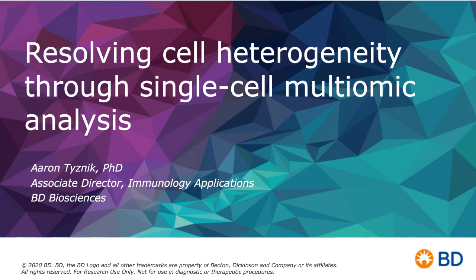Before the broader questions are taken in, there is a consistent cadence of queries that came along, and I thought we could just answer them from the onset. There are a lot of questions regarding the number of cells that can be loaded on the Rhapsody cartridge, cell viability, the amount of cells that are harvested, or the recovery rate, and the cost of the total experiment overall. I know it's a bunch of questions lumped together, but Joseph or Aaron, if one of you could please answer them at the onset, we can engage.